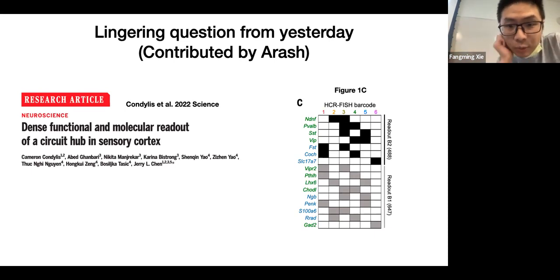Okay, so someone asked, what about the gray boxes? Yeah, gray boxes represent different colors. So in each imaging round, there are actually two colors. So instead of one imaging round for 1 bit, 0, 1, it's actually one imaging round for 2 bits, where each color represents 1 bit, if that makes sense. Let me know if you are still confused whenever.